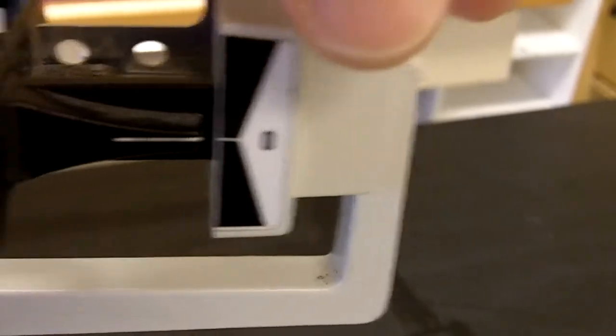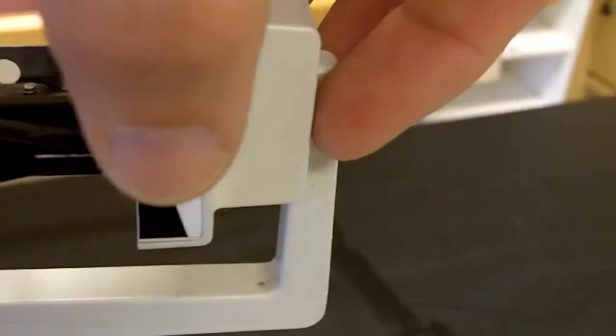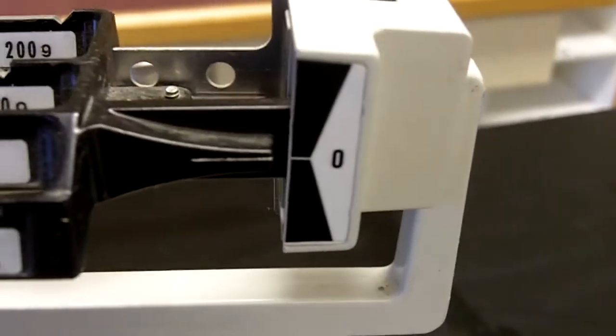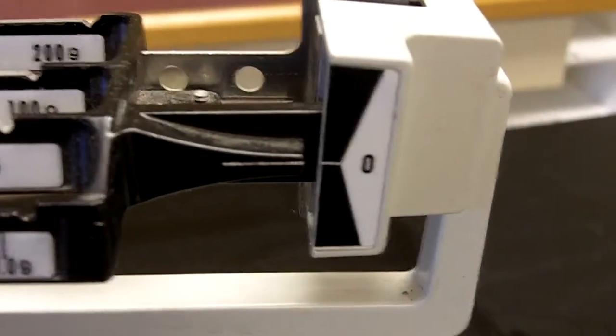It'll teeter-totter all day long unless you kind of bring it right to 0 and move your thumb away. That's what I like to do. And that solved our problem. It's pretty much right at 0. Okay, let's go back to our checklist here.